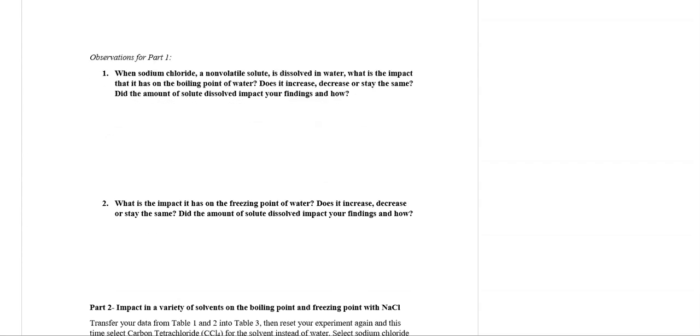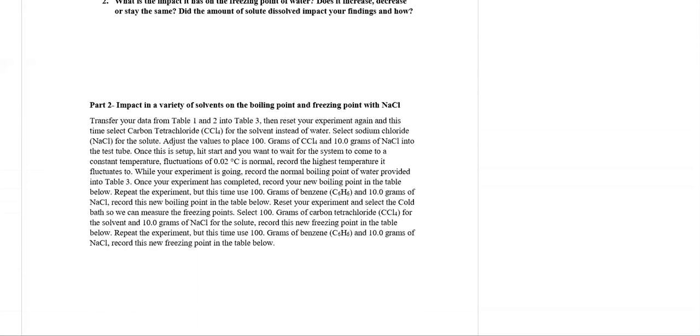Once we have that, there's going to be some questions that you would answer about that. So sodium chloride is a non-volatile solute, right? What is its impact? So what did you see when it impacted the boiling point? Decrease, increase, stay the same. And then did the amount impact it? So you make sure you answer both of those questions.